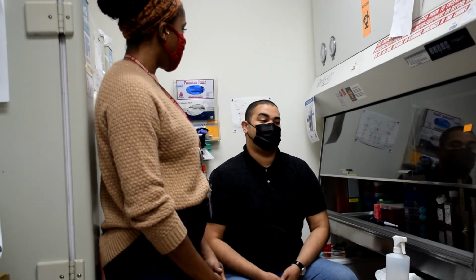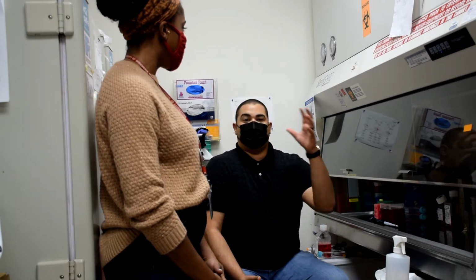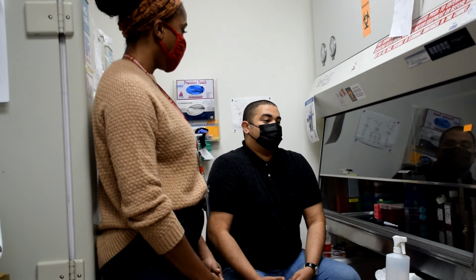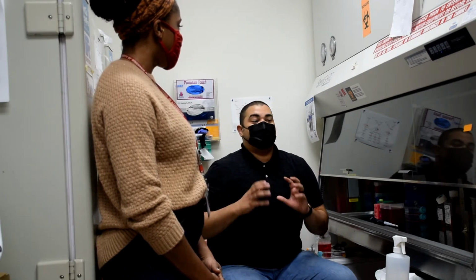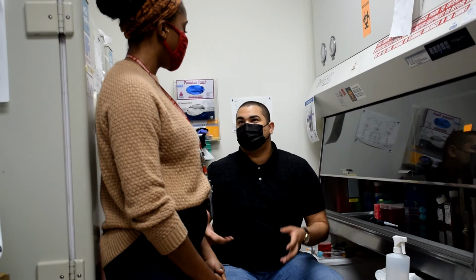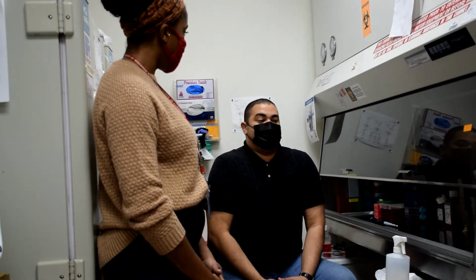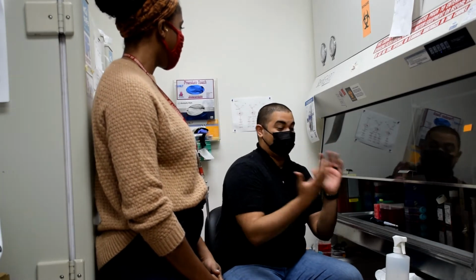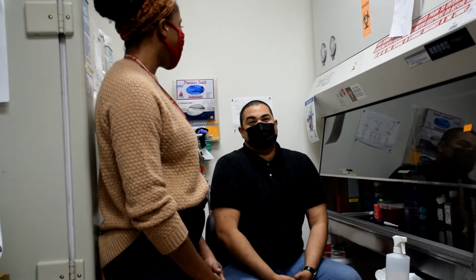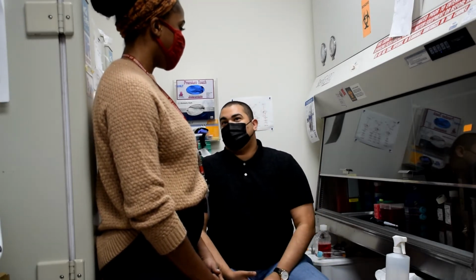You might have heard about different steroid hormones such as testosterone, for example, and estrogen specifically. My project focuses on how estrogens and these hormones can influence or cause prostatic fibrosis. As scientists, in order for us to answer the different questions that we have, we need to dig into a different set of tools, right? One very important tool that scientists here in urology and in other scientific communities have used is cell culture. And this is exactly what I was about to do before you came in here. So I thought I'd show the audience and the viewers back home what using cell culture entails and go from there. Sounds great.